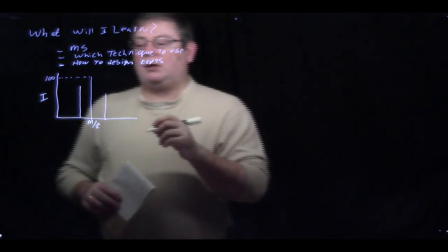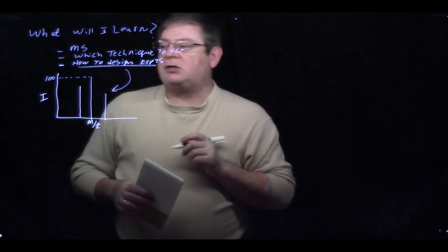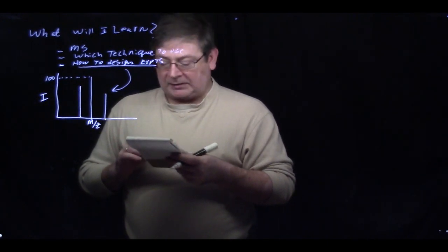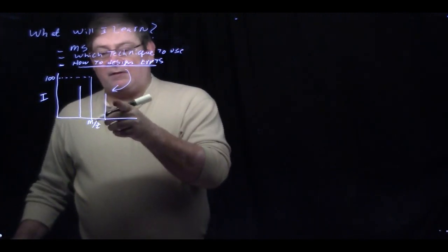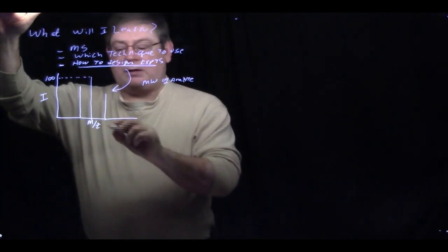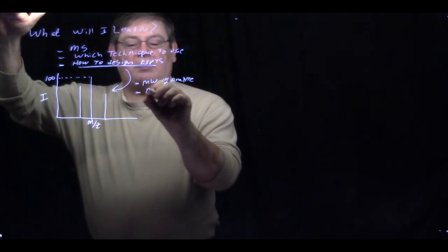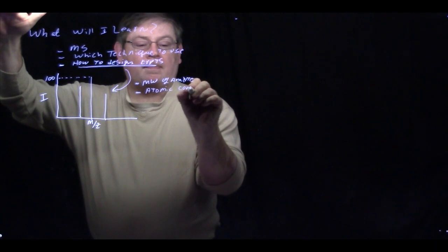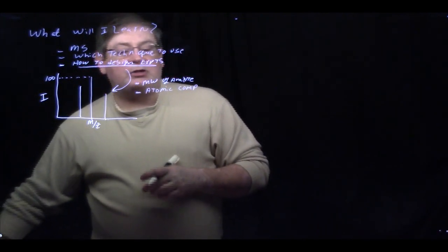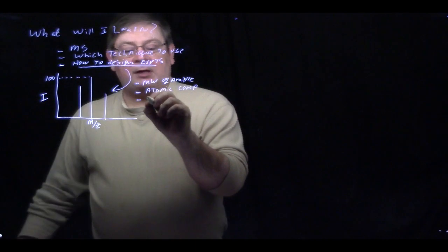But if you use some clever experimental design, if you actually incorporate experimental design with this, you can convert this simple plot into some very, very useful information for your own research. And that's what we hope that you will take from this class. Some of the other things that this kind of information will give you: of course, you can determine the molecular weight of an analyte. If you know the mass to charge ratio, and if you know the charge, you can determine the molecular weight of the analyte, which also means as a result you can determine the atomic composition. So you can get a mass to charge ratio, you can determine the molecular weight, and then you can determine a small narrow set of atoms that will actually be assembled to give you that molecular weight. And as a result, you can also get some structural information.